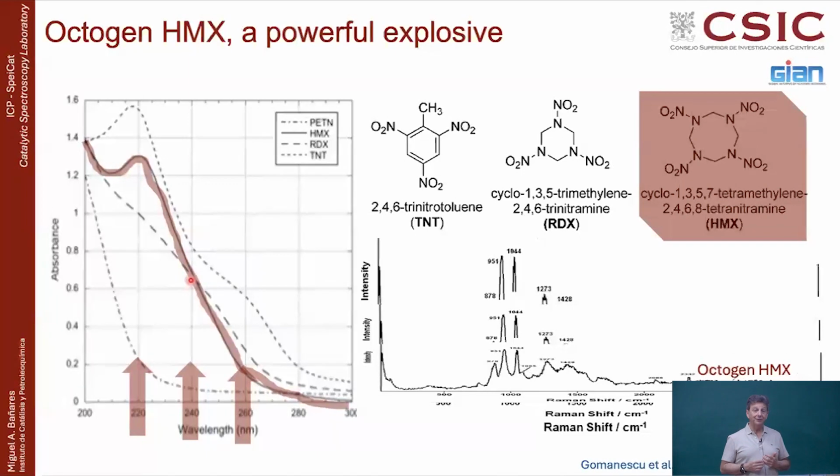Now, you can do something, taking advantage of what I said yesterday about the resonance effect and amplification of the resonance. You can take Raman spectra at many wavelengths of excitation. Typically, you cannot do that with the Raman systems that most of us buy, because basically you have 2, 3, 4 lasers. But there are continuous lasers where you can select the wavelength. And then you can do something very powerful, which is to take spectra at 200, 220, 230, 240, 245, at any wavelength, and see what Raman spectrum you obtain exciting at a given wavelength. Now, what will be the outcome?